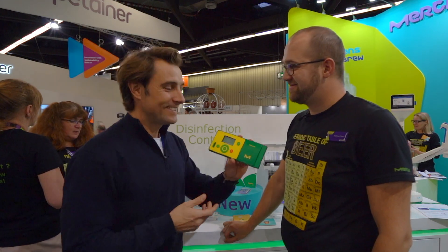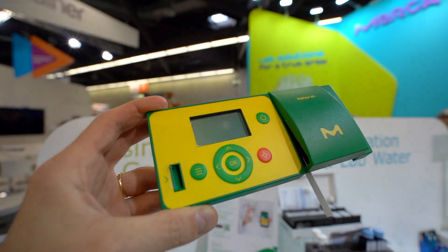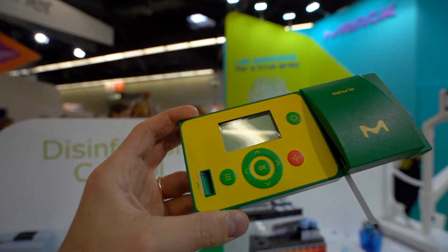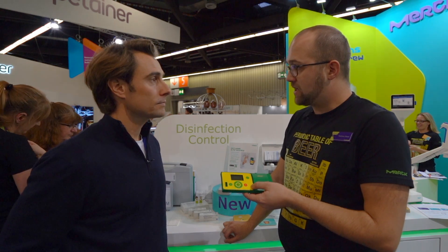Yes. That's it. That's what you want to show us today? Exactly. What is it? This is like a reflectometer. A reflector meter. You measure the color — the color of the reaction zone.